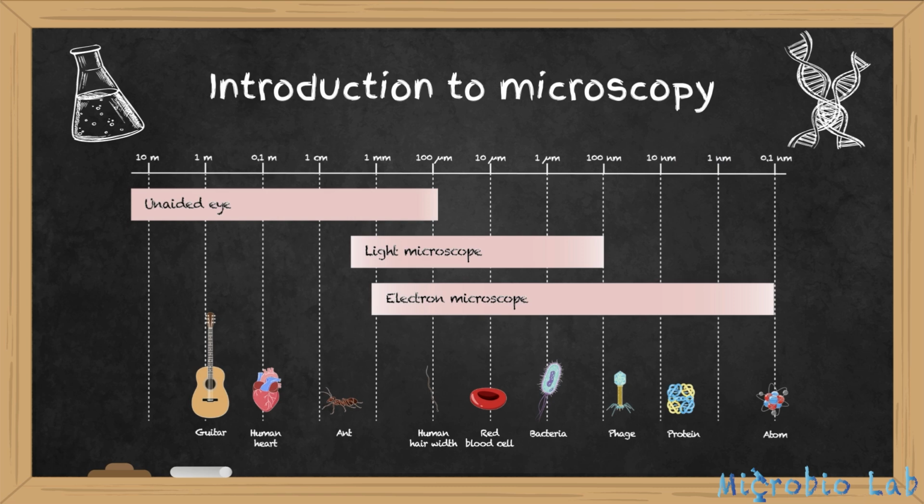From bright field to electron beams, each type of microscope opens a different window on the hidden world. Learning how to use them expands our ability to explore, discover, and understand.